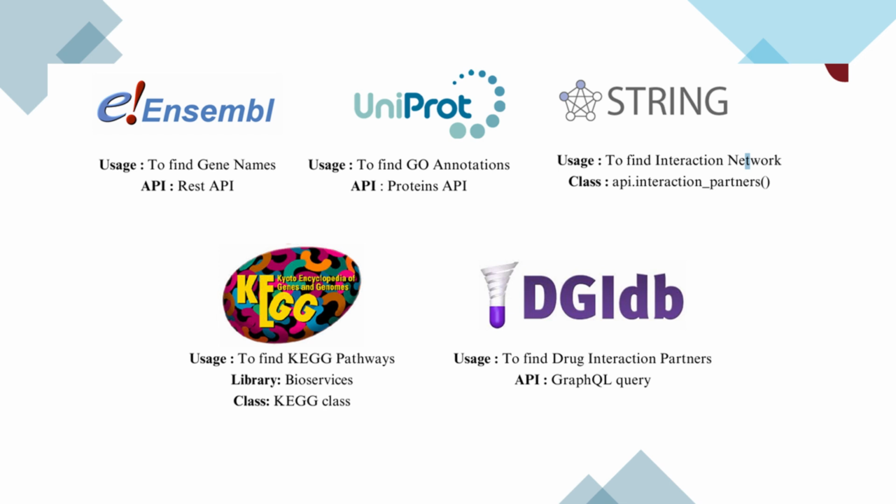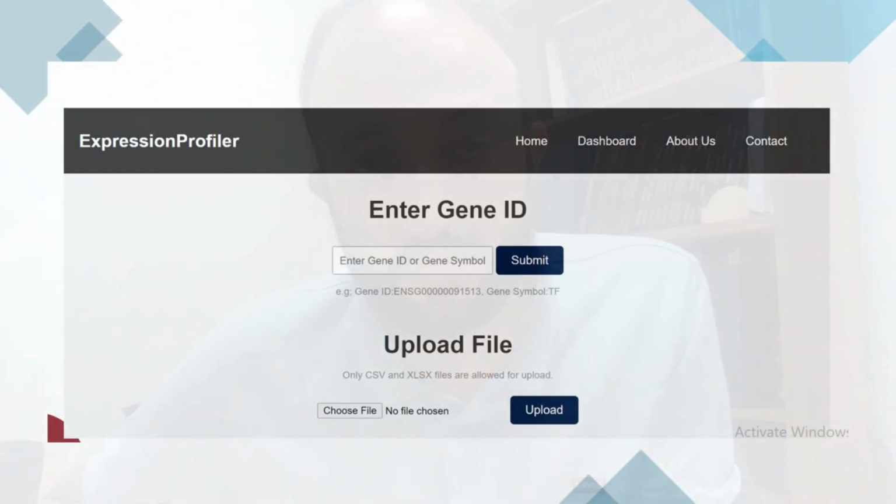So this type of information is interesting because it is under one platform, but we also give another feature which makes it a standout. There are very few tools available for that, and we have tried to add a lot of value into our software which is not available in the previous softwares.